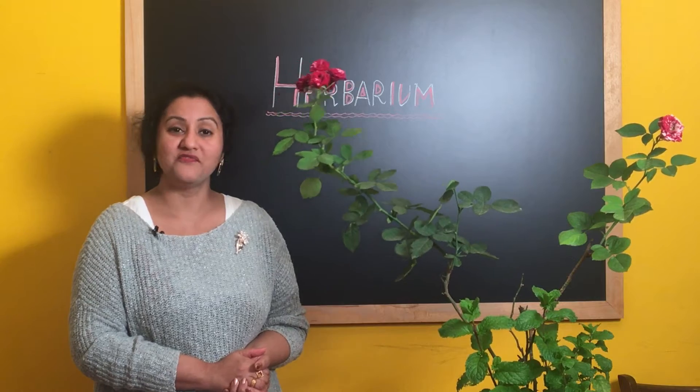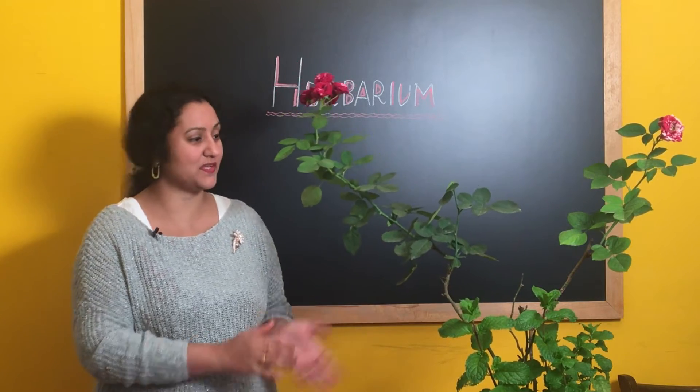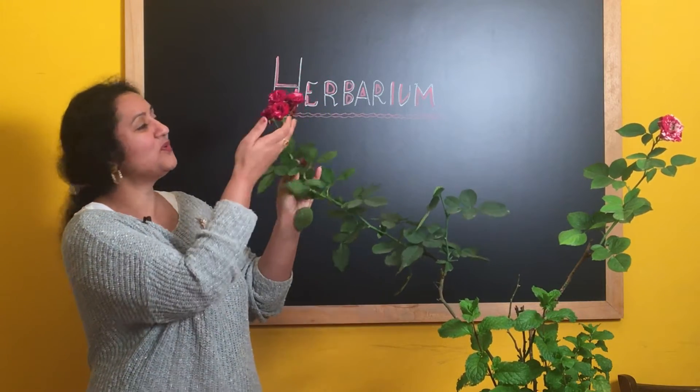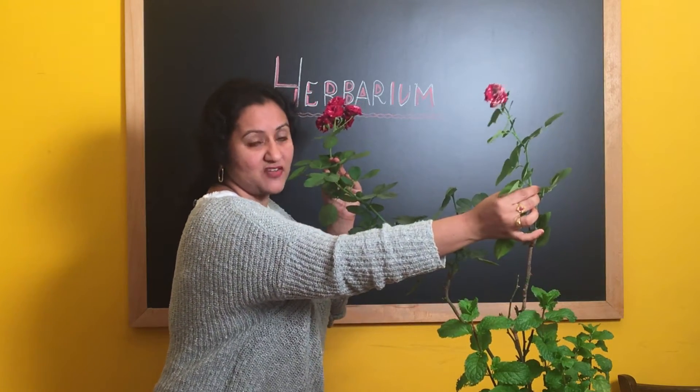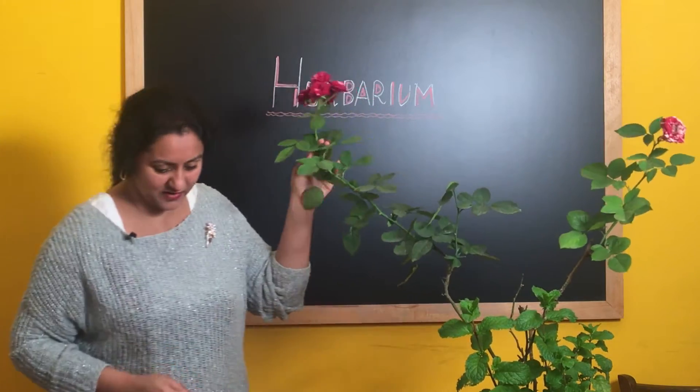Let me show you what materials are required for this and easy steps to make a herbarium. First and foremost we need a plant specimen. This is my beautiful roses, so I have decided to choose this branch for making the herbarium.